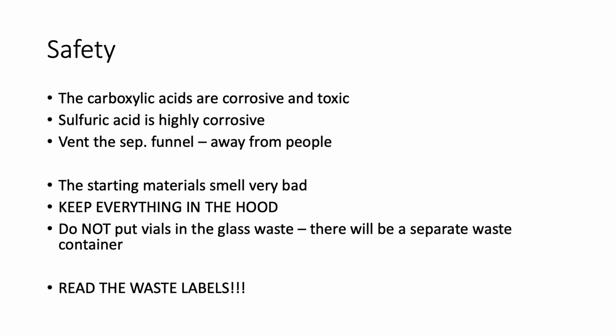Do not put vials in the glass waste. If anything breaks, or if you break a pipette, or if you break a beaker or something that has contacted your solutions from the ester lab, there will be a separate waste container for those. Your TAs will come around with a capped plastic solid waste container to collect all your vials so that they are not in the glass waste stinking up the entire lab.